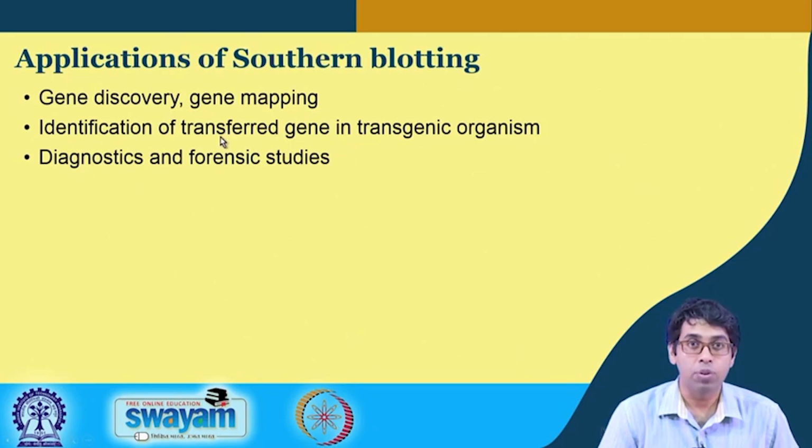It is also used to identify transferred genes in transgenic organisms. So, suppose we have created a transgenic organism where we have added a new gene which is not present in that organism under natural conditions. Now, to test whether our experiment has worked or not, we will use Southern blotting techniques, and it is also extensively used for diagnostic and forensic studies.